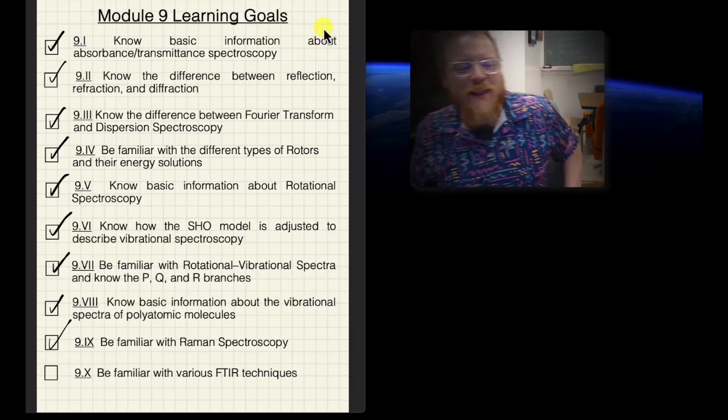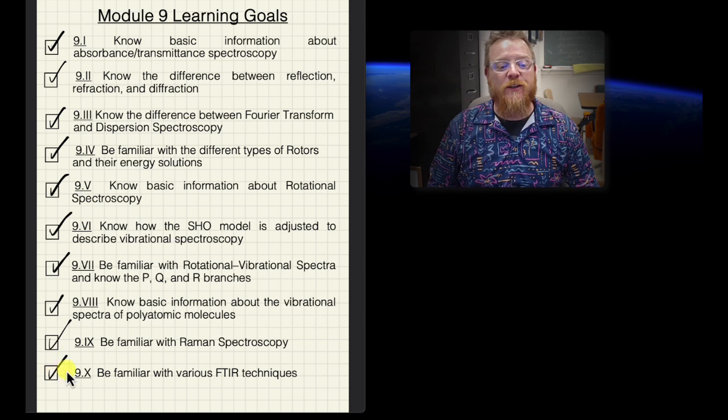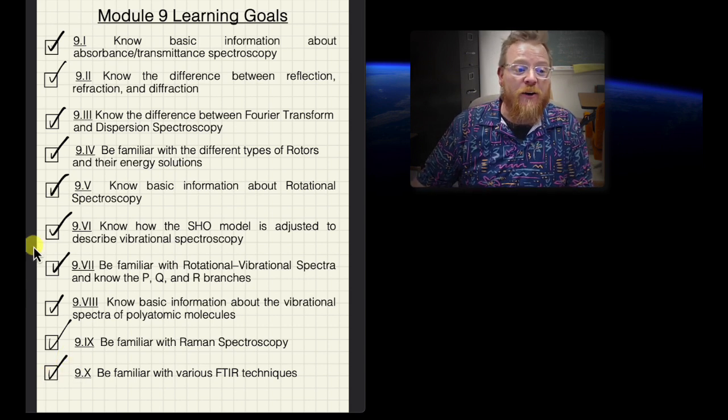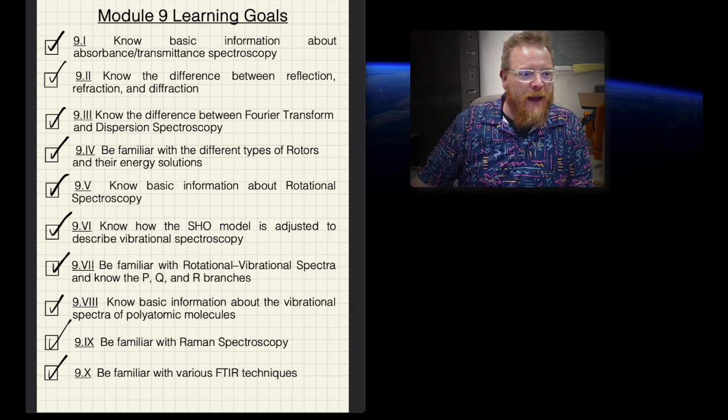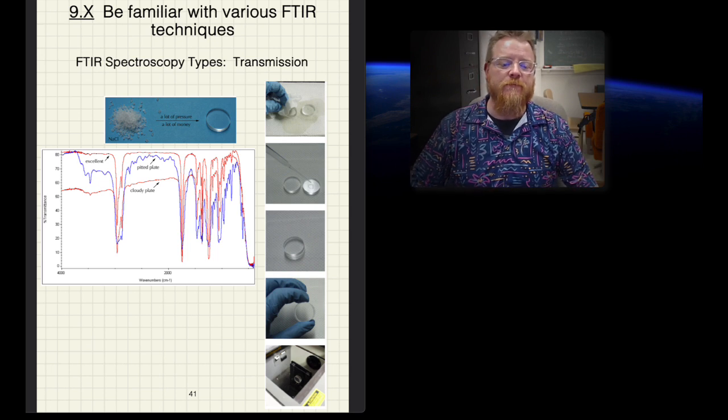Okay, folks, for this last learning goal in this module, I just want to very briefly talk about some of the various FTIR techniques. And you've done, I think, both of these techniques at this point in your education here, or at least two of the ones that I'm going to talk about. But I thought it'd be nice to at least give us some familiarity with that.